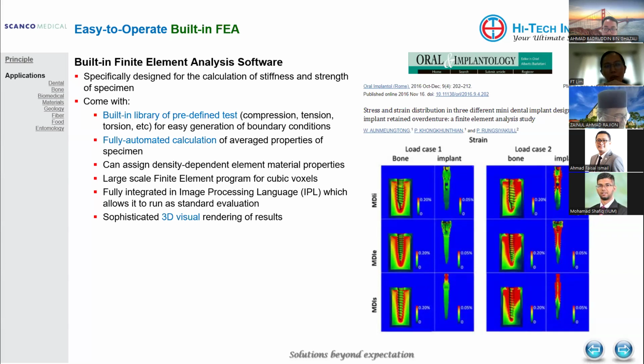Yes, in ScanCo they do have a script. They have a script that they call registration, where one scan is before and one is after. So you have to scan the same object before and after. Then the software will align them, stack them together, and then compare whether there is any growth, increase of the size, volume, or changes in the densities and things like that.